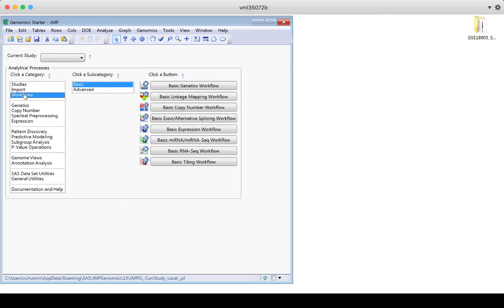So the workflows are sort of a simpler entry point into JMP Genomics where you're not as overwhelmed with all the options and it presents them in a clear path. But you may find yourself at some point deciding to skip the workflows altogether and create your own analysis process by using your own combinations of those individual analytical process category and subcategory buttons one after another or iteratively back and forth.